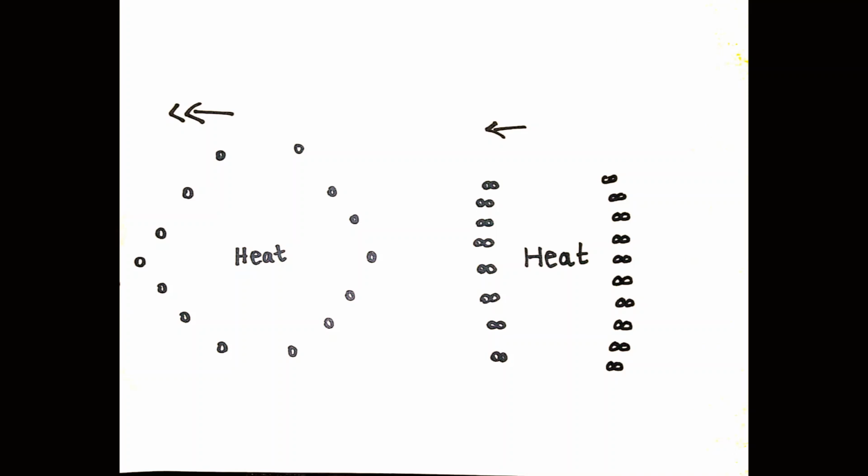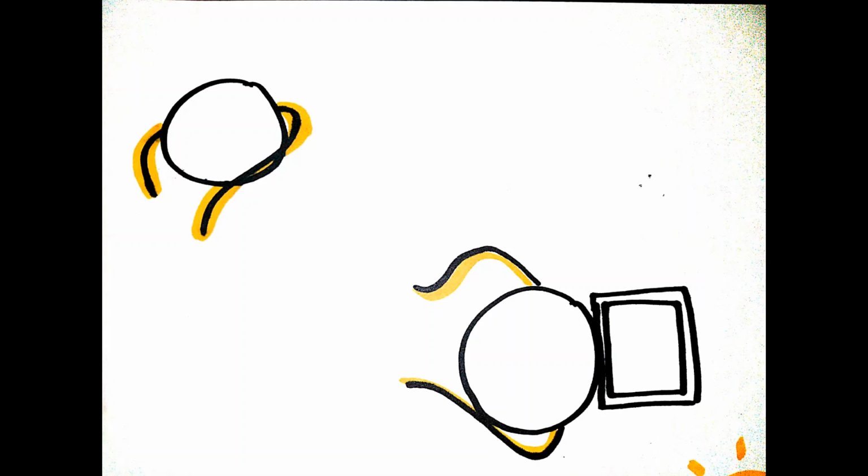Molecular flow along the temperature gradient is opposed by mass diffusion. This is like Newton's first law. Objects do not like to change their state if they don't have to. After some time, both effects balance and this is called the steady state. But how can we image this motion?